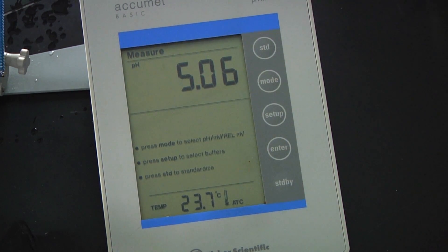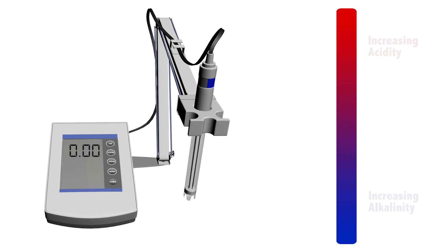Now the pH meter is ready to be calibrated. We need three known standards: an acidic 4.0, a neutral 7.0, and a basic 10.0 standard buffer solution.